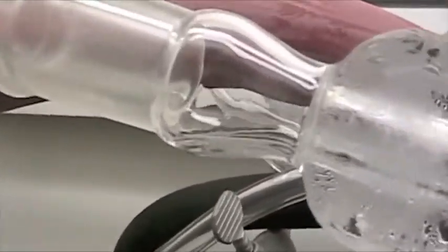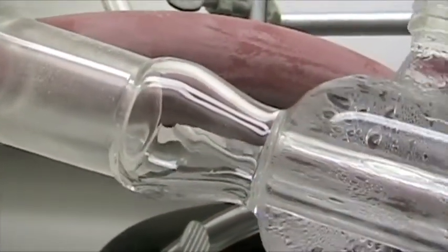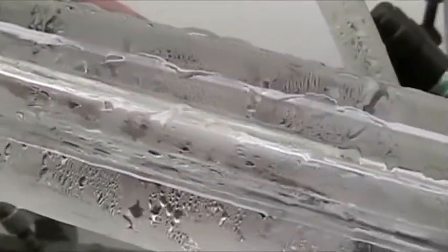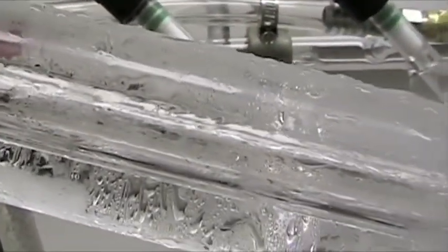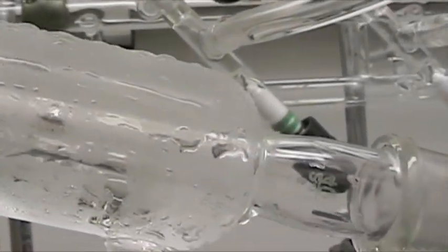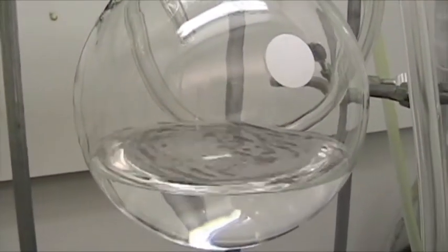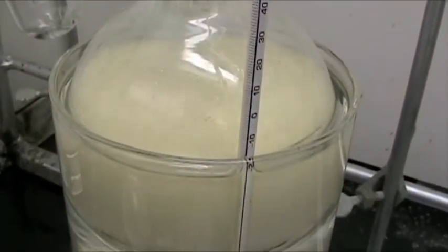And so this solvent, once I know it's pure — I'll run some tests on it to check for purity — I will put it into the big solvent still for us to use in our reactions. You can see the gas kind of flows in and then immediately condenses to a liquid, and then drips in there. So it's nice and pretty, colorless, transparent. But it started out as this yellowish liquid over here with the calcium hydride in it, and now it's all nice and pretty.